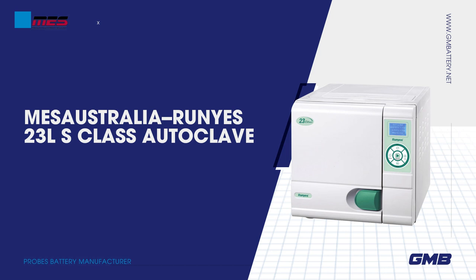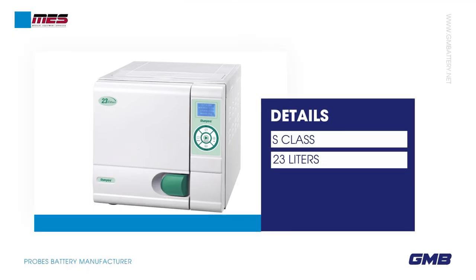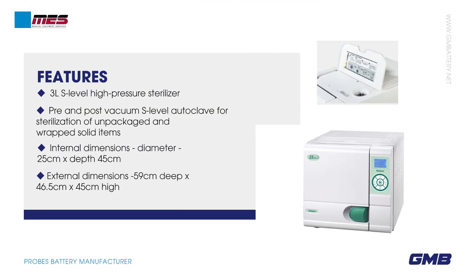Class 23-liter autoclave details. Level high pressure sterilizer, pre and post vacuum, for sterilization of unpackaged and wrapped solid items. Internal dimensions: diameter 25 cm x depth 45 cm. External dimensions: 59 cm deep x 46.5 cm x 45 cm high.